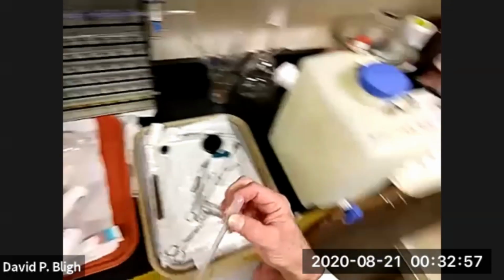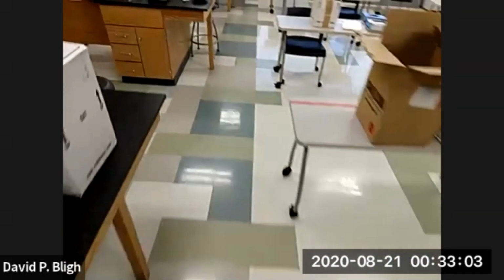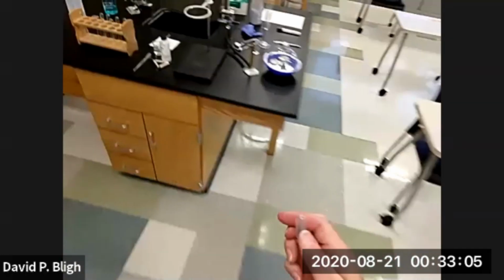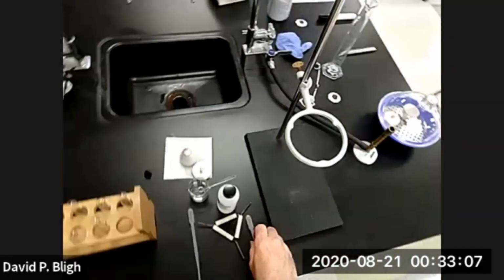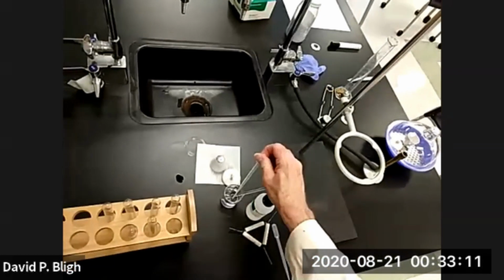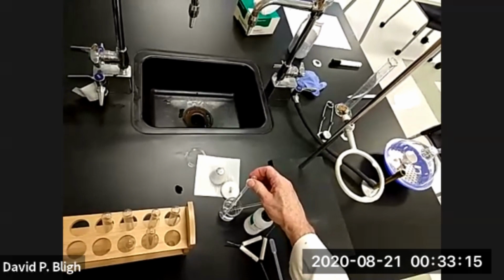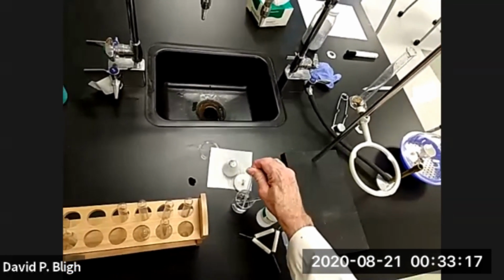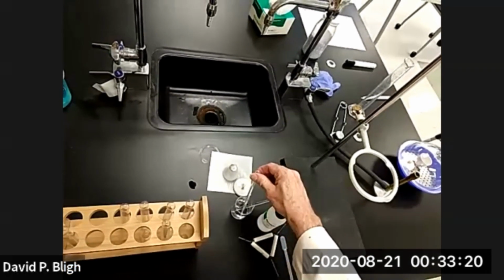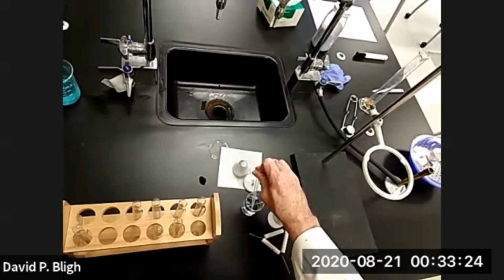Let's see. Here's another one, which has been thoroughly cleaned and is dry. So I just need to measure out exactly the same amount of each one. So let's measure this one out. Let's go up to the bottom of the bulb. How about that? Well, it's not going to be cooperative.